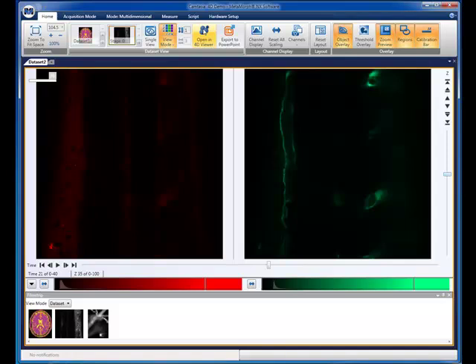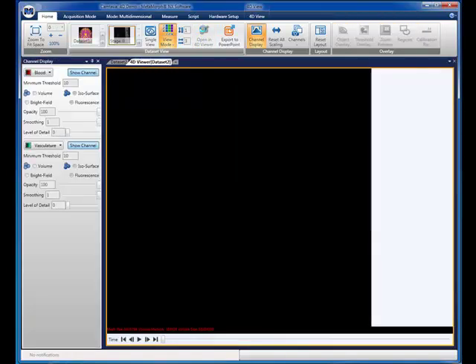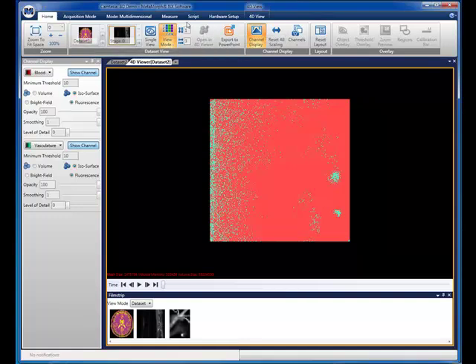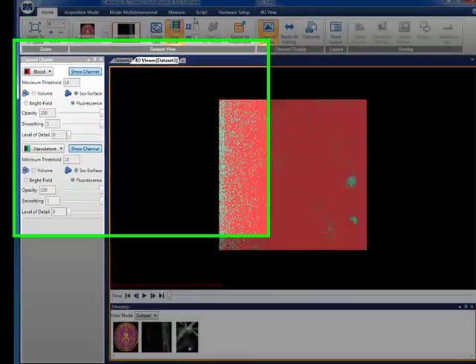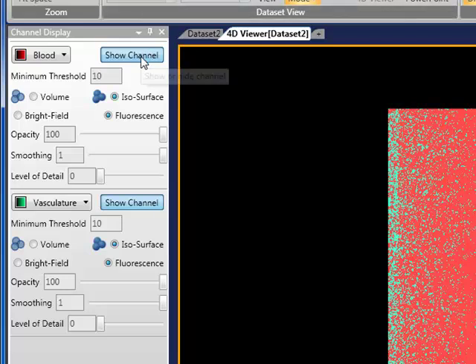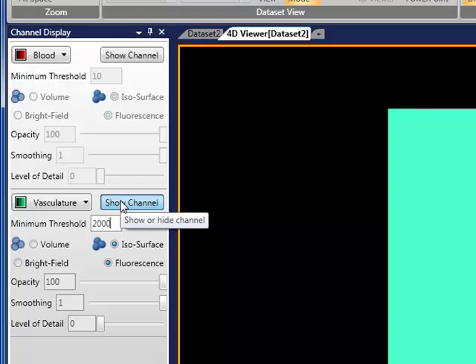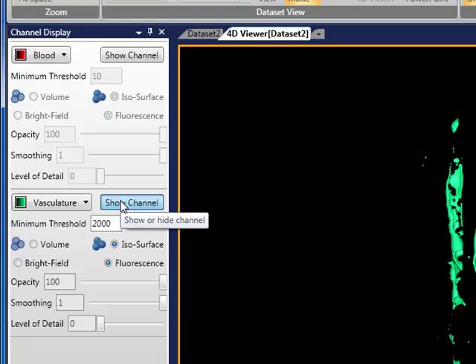Now let's take a look at this data in the 4D viewer by simply pressing the 4D viewer button on the ribbon interface. To render the image, we will need to make some adjustments. We do this through the channel display dialog to the left of the main display area. We will turn off the first channel and set a threshold on the second. By setting a threshold, we will only show pixel values that are associated with our object of interest — in this case, the zebrafish vasculature.